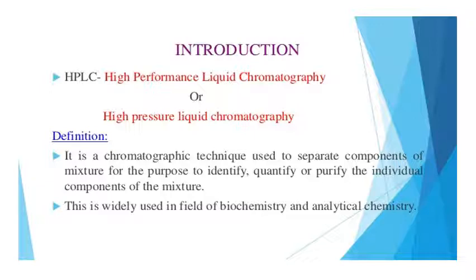So what is HPLC? HPLC is high performance liquid chromatography, or it is also known as high pressure liquid chromatography. It's a modified version of the liquid or the column chromatography.